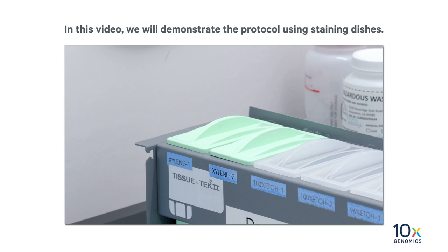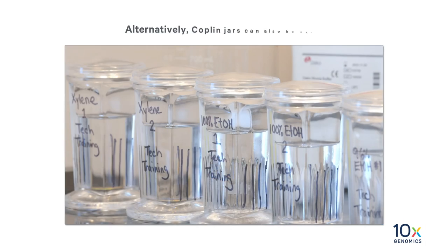We have tissue sections on plain glass slides. We will now proceed to deparaffinization. In this video, we will demonstrate the protocol using staining dishes. Alternatively, Coplin jars can also be used.